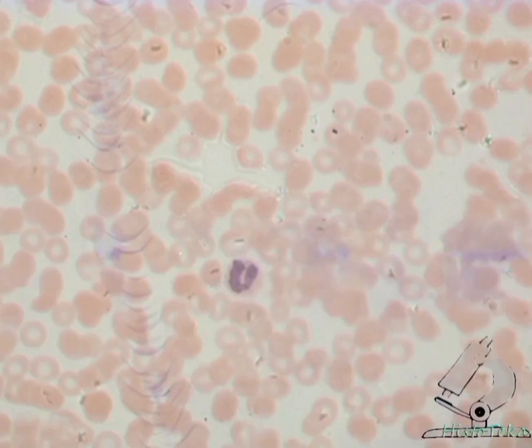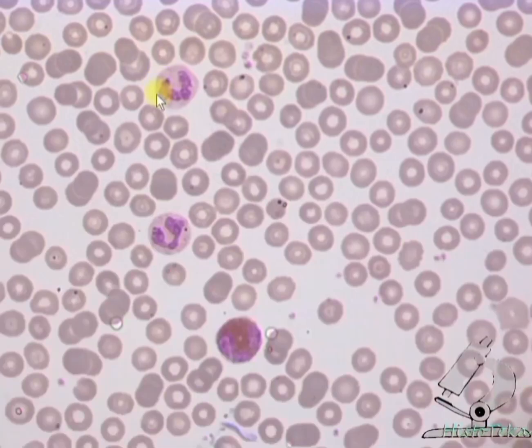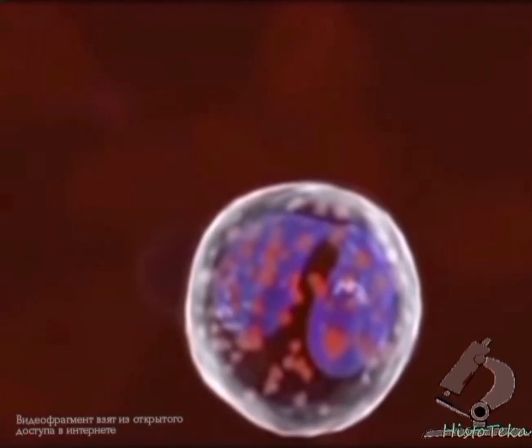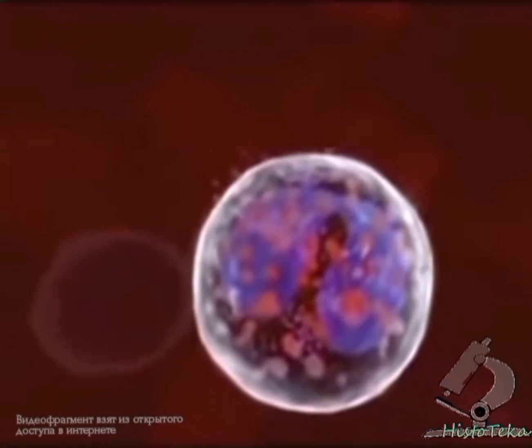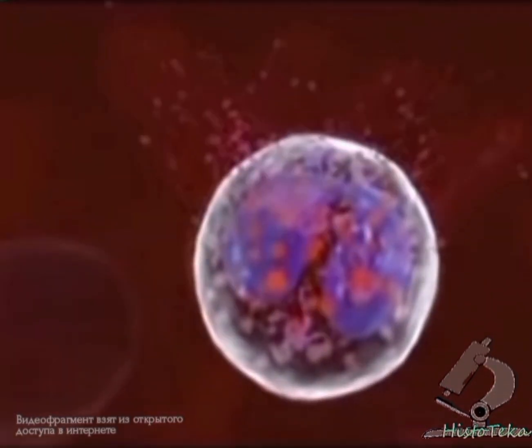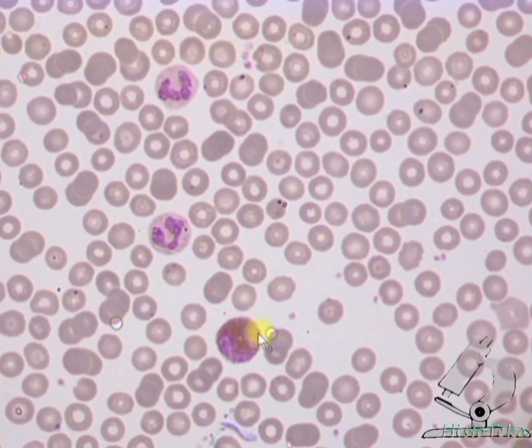Rod-shaped neutrophils are much less common, up to 6%. Their nuclei resemble a curved stick, most often in the shape of a horseshoe or the letter S. Rod-shaped neutrophils. The next type of granulocytes in terms of frequency is eosinophils, up to 5%. Their cytoplasm is dominated by eosinophilic large granules, and the nucleus has 2 lobes, less often 3.